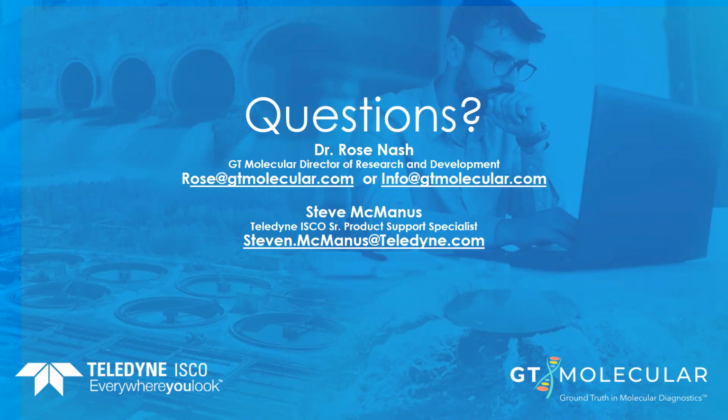In general, when we're bringing on new customers and getting them up and testing, we always recommend using an autosampler because the data is in general so much more robust and the samples are just easier to work with. However, we do like to keep grab sampling as an option for some of our customers coming online that might not have access to a sampler.